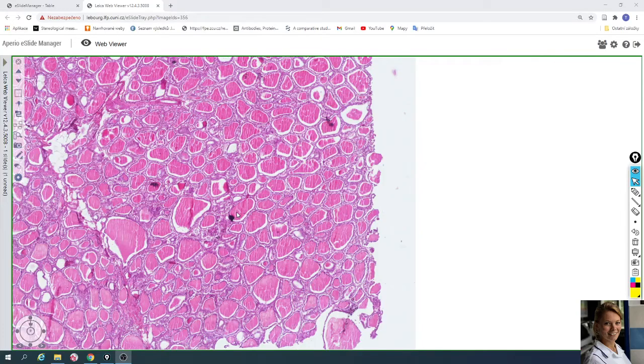In this video we will take a look at the slides of thyroid gland. The slide is stained with hematoxylin and eosin.